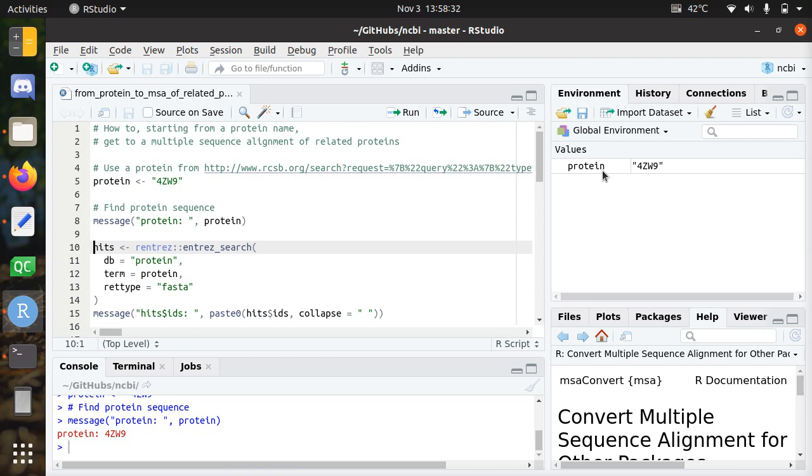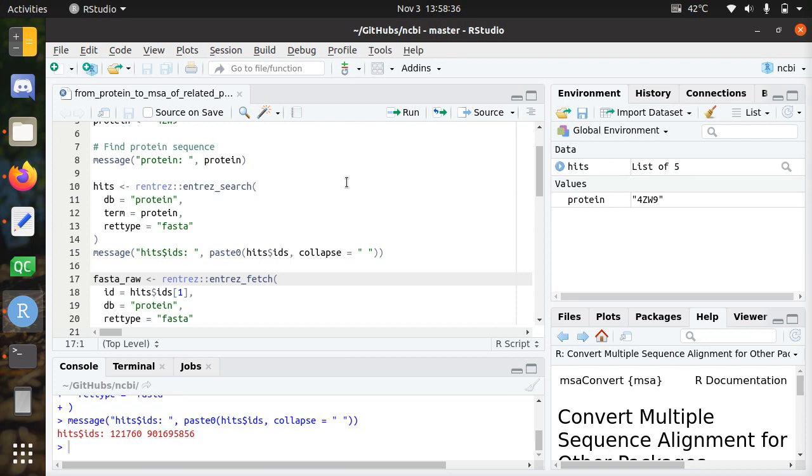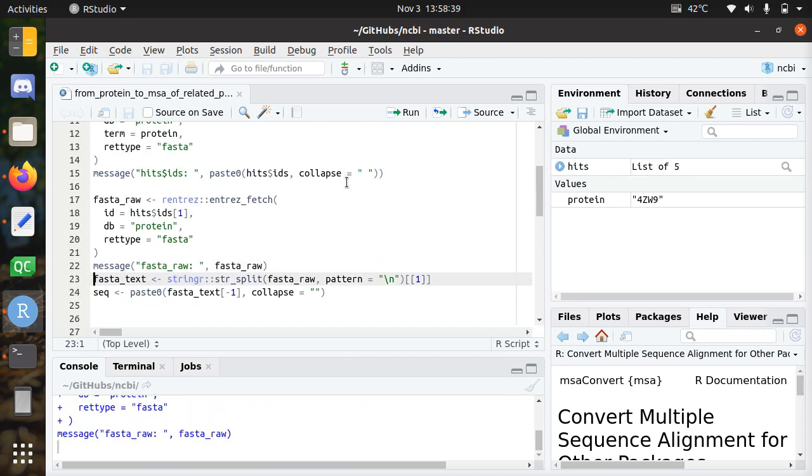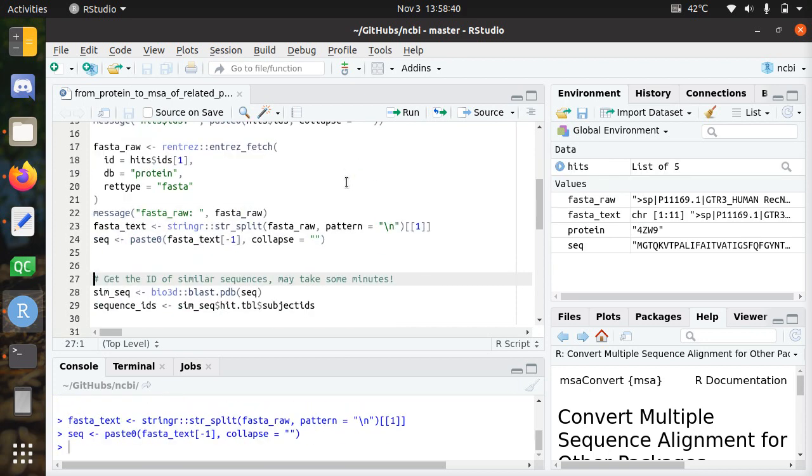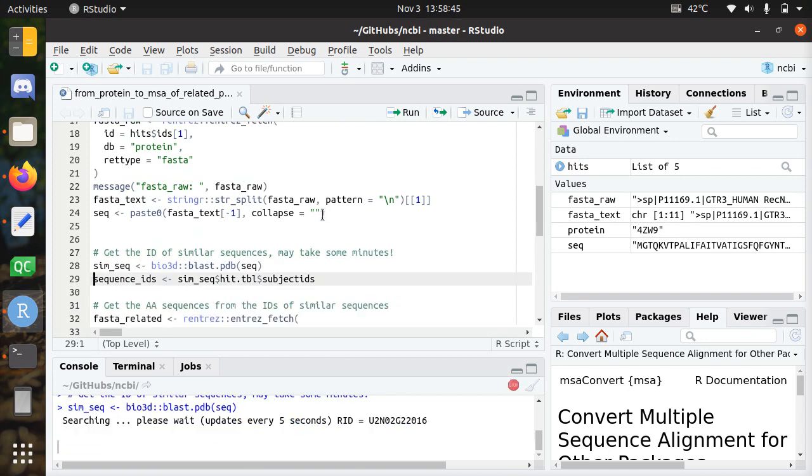I'll go through this later, but first I get an ID. So I look for the ID of the protein, I get the sequence of the protein, and then I'm going to look for related sequences using BLAST-P. This may take some minutes.